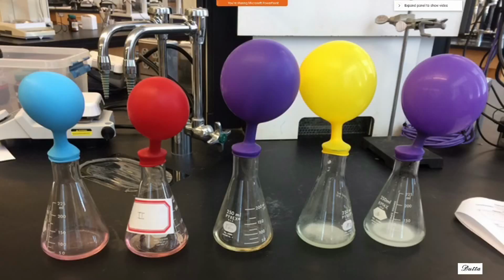So you added 25 milliliter of acetic acid, plus you had an indicator, HIn. 25 milliliter of acetic acid plus indicator, again 25 milliliter acetic acid plus indicator. And you had the sodium bicarbonate in the balloon, NaHCO3.